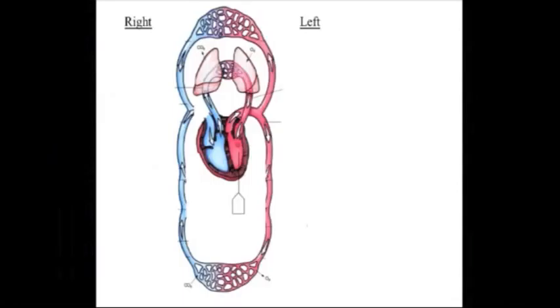Next, we are going to take a little post quiz to, one, assess your understanding of the cardiovascular system as I have detailed it earlier, and second, it's going to test your understanding of the procedure that we just conducted and see if you can link the procedure to, or see how the procedure utilizes the basic mechanisms of the cardiovascular system in order to drain the blood. So the first image we have here shows two things. This is our cardiovascular system in the context of the mouse. I'm just using a diagram in order to make it simpler.